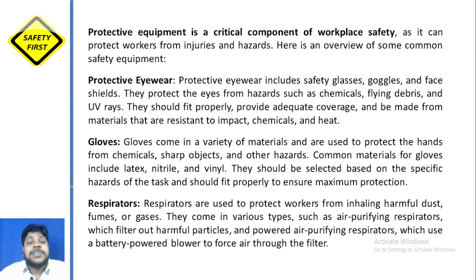जैसे कि आप अपने आसपास ही देखिए, बहुत लोग मोटर बाइक चलाते हैं and they don't want to wear a helmet, और और भी बहुत सी ऐसी चीज जिसमें हम लोग ध्यान नहीं रखते, तो वो कितने तरह की प्रॉब्लम्स क्रिएट कर सकते हैं. You should be aware about it, and whenever you're working in any environment where these protocols are there, you should follow these protocols. There is nothing great about not following the protocols, not wearing protective equipment. So there is nothing great about it.